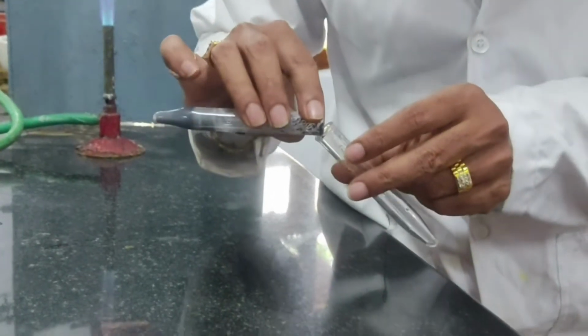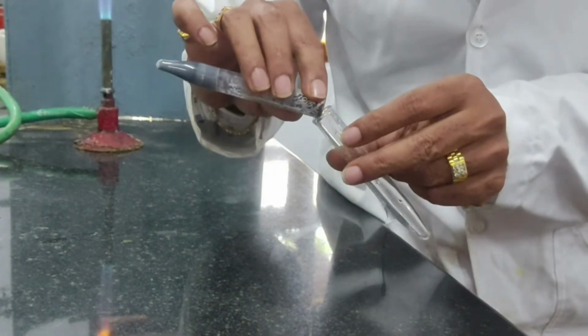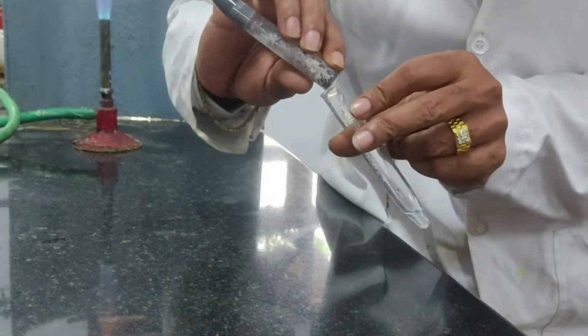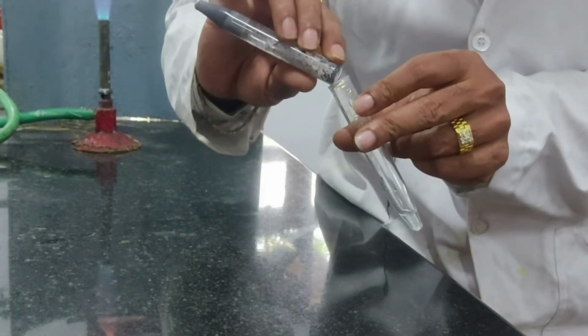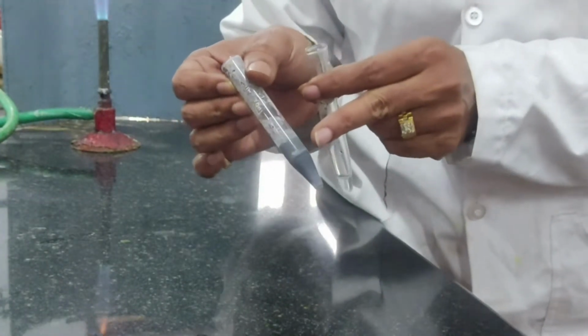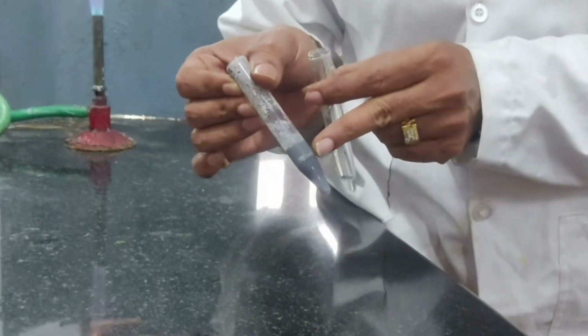Slowly I have decanted the centrifugate. So this is the 4th group residue that should be tested for the presence of Zn+2 or Ni+2 or Mn+2. So this is the residue that I have obtained after adding 4th group reagent to the original solution that is supplied to me by the lab attendant for 4th group analysis.